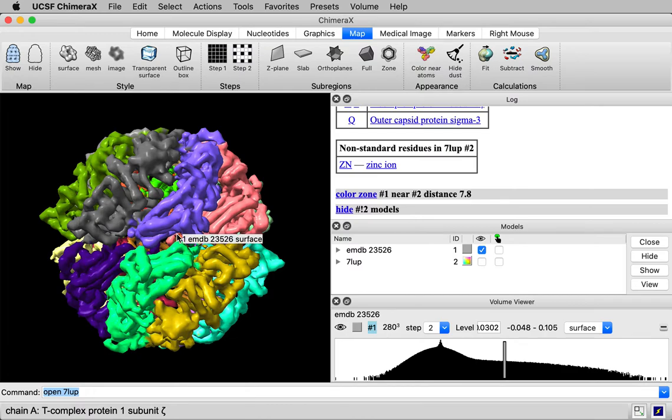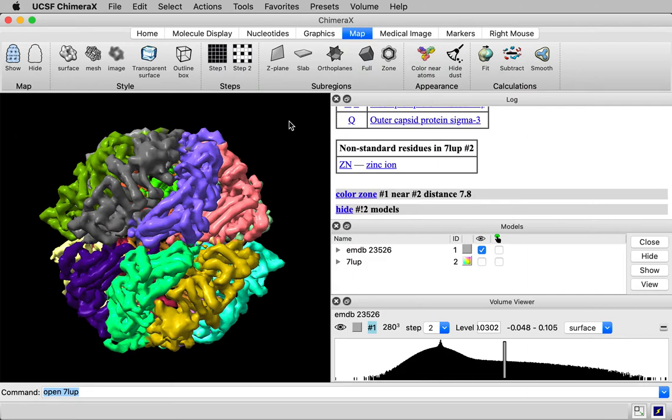That toolbar button will only be there in the version of ChimeraX that's newer than March 2021.